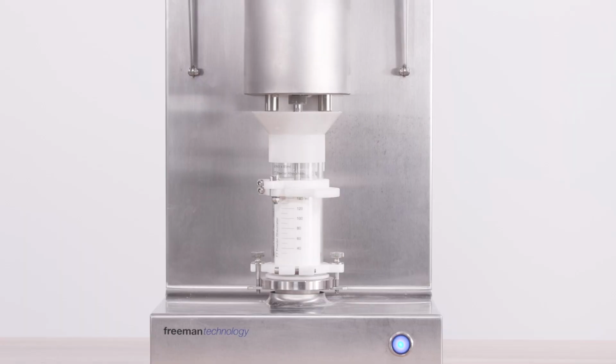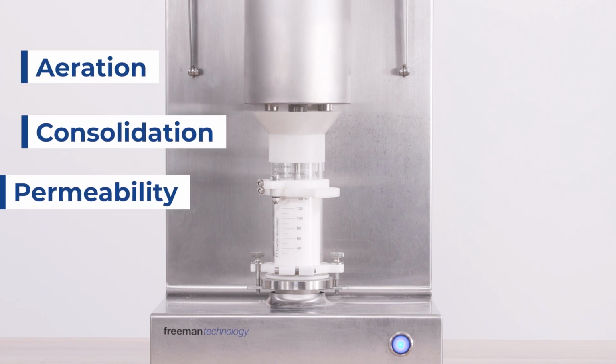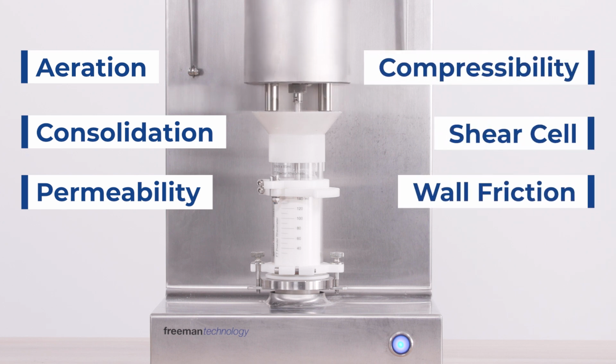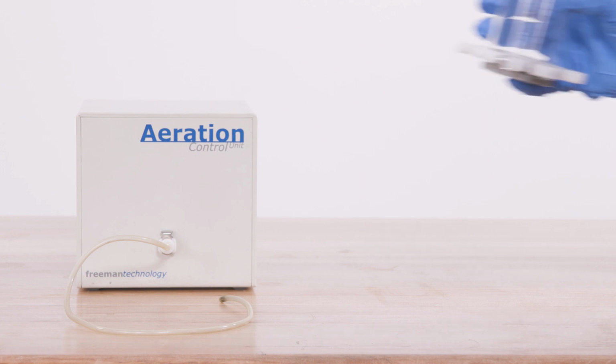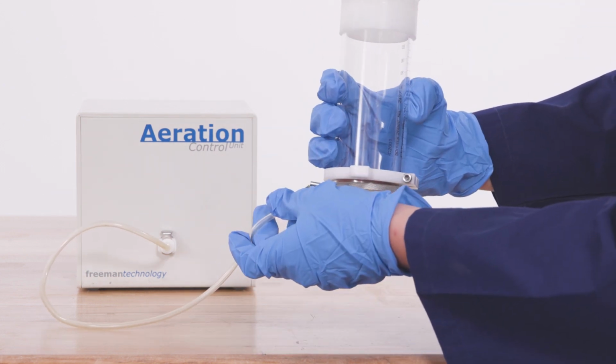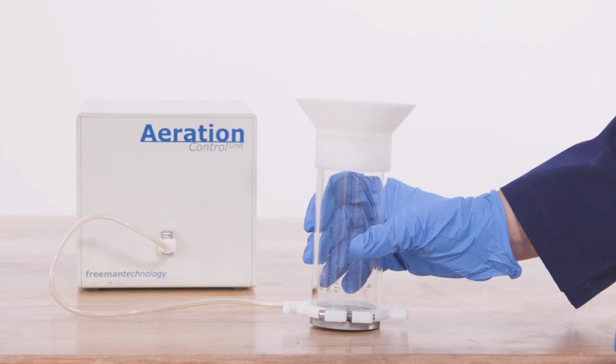The FT4 offers various different options for analyzing powders, with tests such as aeration, consolidation, permeability, compressibility, shear cell, and wall friction analysis. One of these additional tests we can perform with the FT4 is the aeration test. This test will use the aeration control unit as well as a special vented base which connects to the ACU.